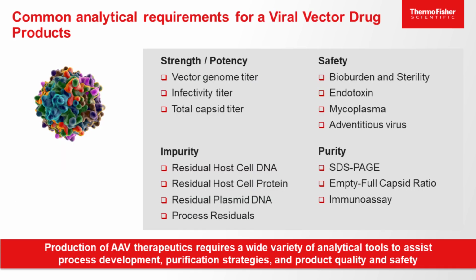In addition to the areas of increased concern and scrutiny, there are already a myriad of analytical assays for characterization and release testing for viral vector products that fall on analytical teams' shoulders. Shown here is a list of expected tests for viral vectors. Most release assays can be categorized as either strength, safety, or purity assays. Some of these are specific to each process or drug product and therefore need to be developed in-house, while others, such as mycoplasma detection assays, are more universal and not specific to a particular process or product.